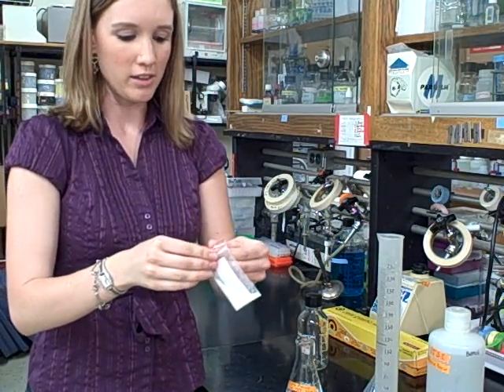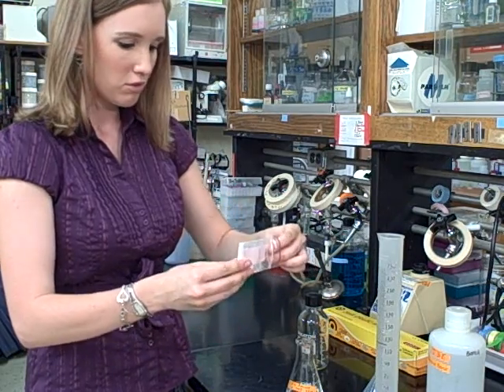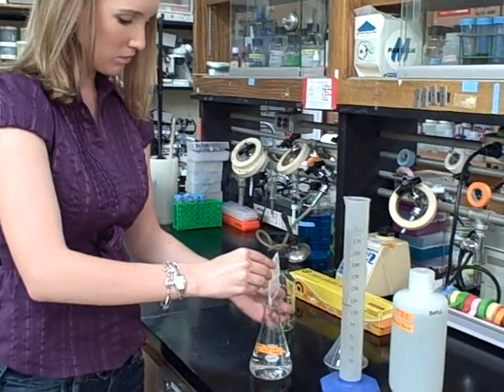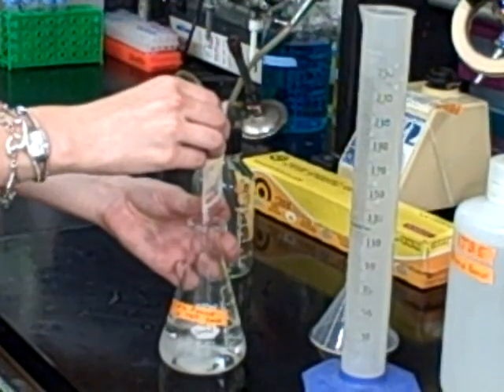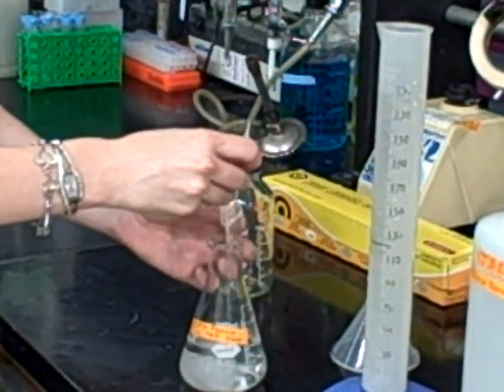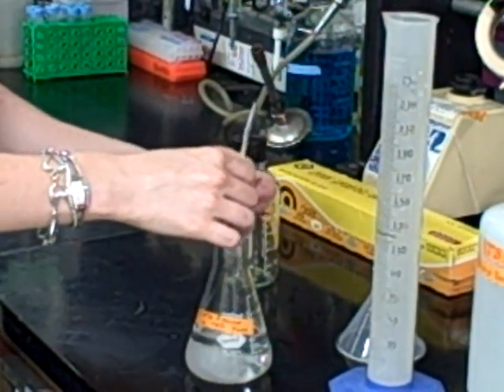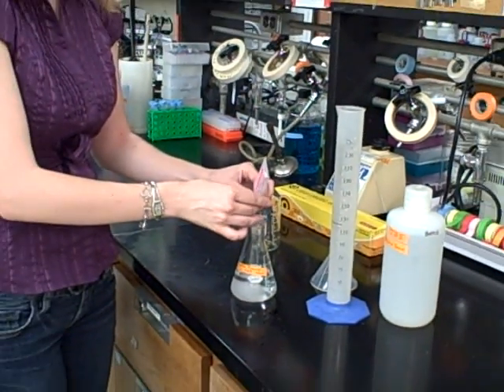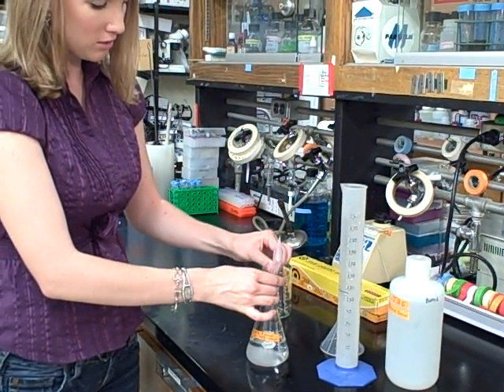I'm just going to add the entire packet of agarose into the flask. I'm going to try to get as much out of it as possible. You can always rinse out the bag if there's a little bit of residue stuck in there.